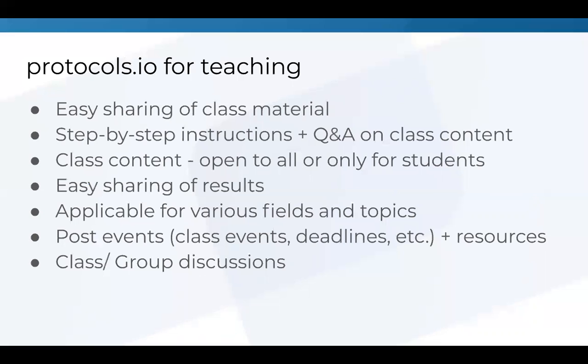So if they're following a protocol in the lab, for example, and they want to share the results with you afterwards, they can just click share on their experiment record, and they can share the results with each other or with the instructor. And then also it's very applicable for various fields and topics. As mentioned, it's good for lab classes, computational classes. Also, if you're doing a field trip or something, it can be really good for instructions for that. So there's really no limit to what you can do with it.